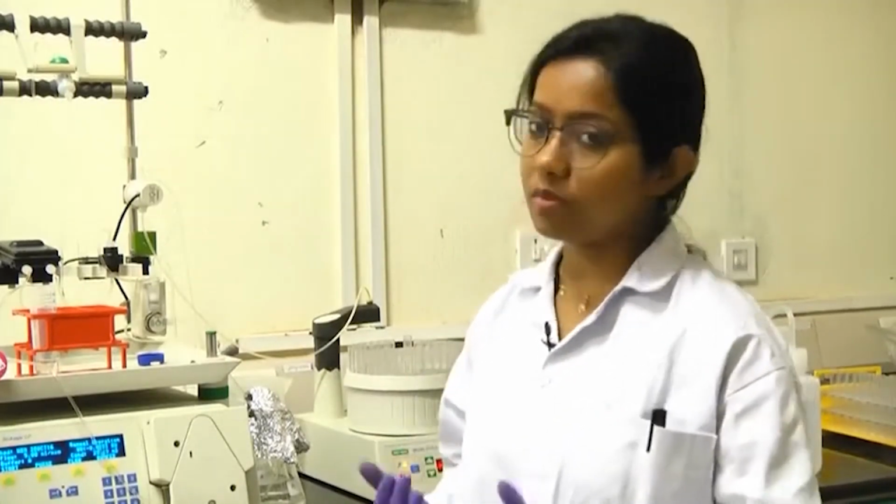We will measure the absorbance at 280 nanometers, and if you know the molar extinction coefficient of a protein, you can measure the amount present in the solution from the extinction coefficient and the absorbance. This way you can estimate how much protein you have and what its purity is.